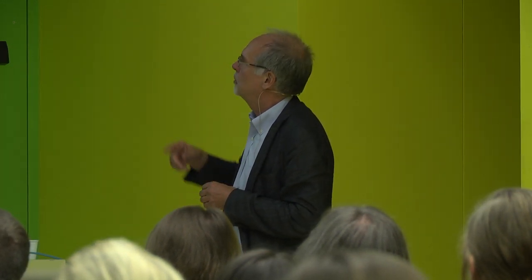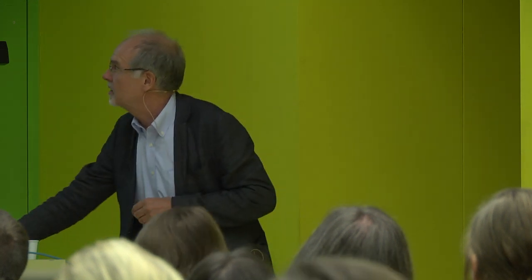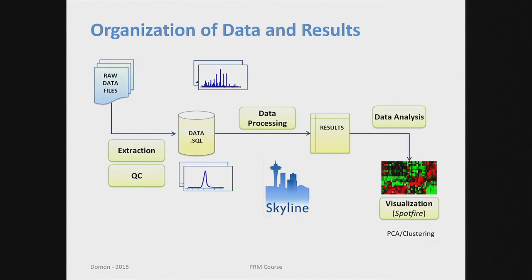You have your different traces, and then your system can just take 2 or 3 traces, depending on how you do it. If you're not quite happy with these traces, you could just go back and request another set of traces and integrate them. But that means you collect the data only once, and then you have quite a bit of flexibility in terms of processing and analyzing your data. Right, and that's basically everything I already said.